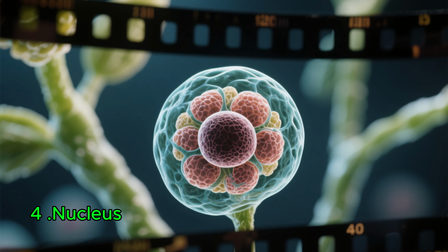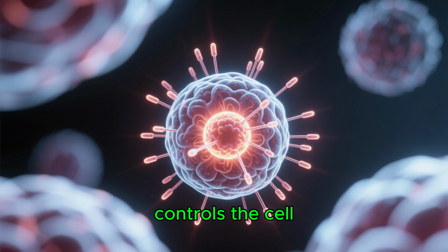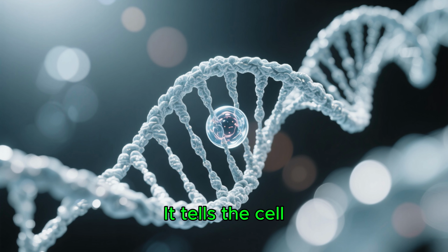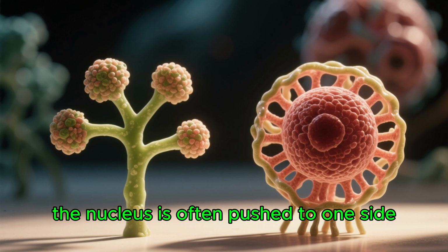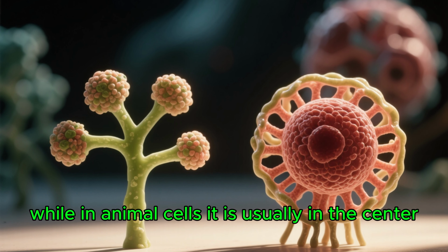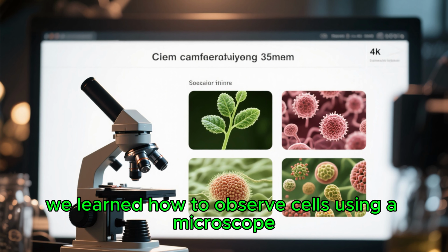4. Nucleus. The nucleus is found both in plant and animal cells. The nucleus controls the cell. It is like the brain of the cell. It tells the cell what to do and holds the cell's instructions called DNA. In plant cells, the nucleus is often pushed to one side, while in animal cells, it is usually in the center. Summary. In this lesson, we learned how to observe cells using a microscope.